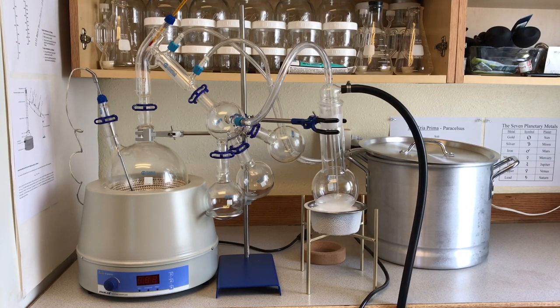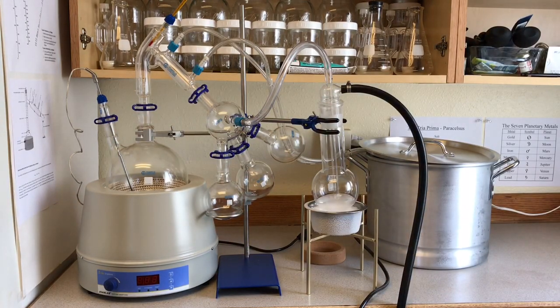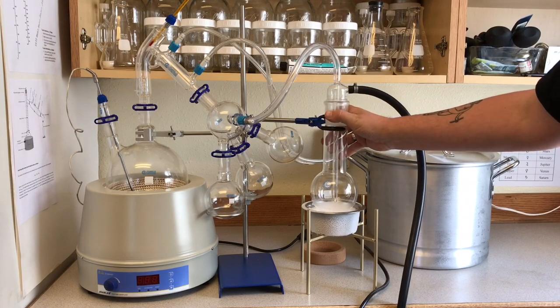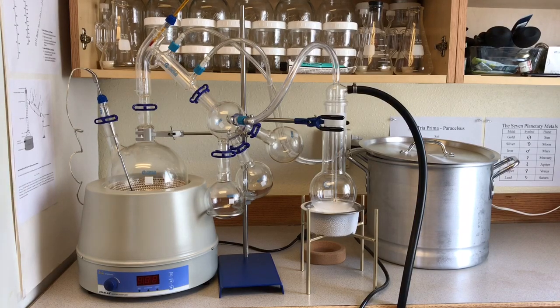The next thing I'm going to do is put a funnel here, and I'm going to start funneling in my material. So first we'll go over a couple of these scientific explanations of the different types of distillation. And when we're done going over that, then we'll be ready to start running our material. So before we move on to part 2 of our video, I just wanted to go over real quick some of the different terminology and some of the different concepts, not only from an organic chemistry perspective, but also from an alchemical perspective.